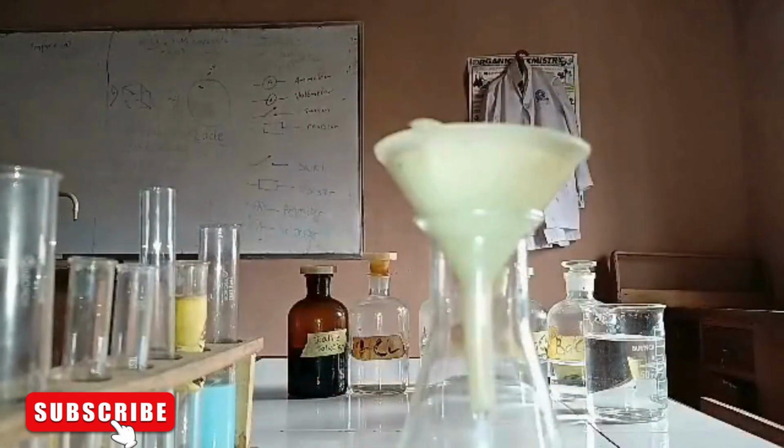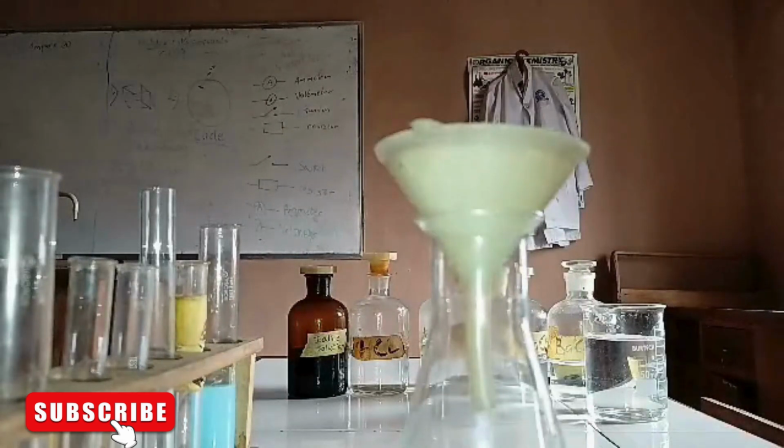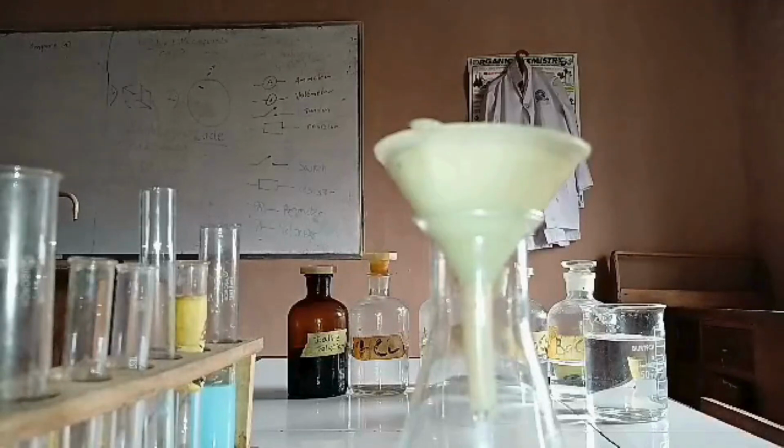It's important to note that what we will have in the conical flask is considered the filtrate, and what we have remaining in the filter paper will be considered the residue. So let's just wait for a bit for the filtration to finish.